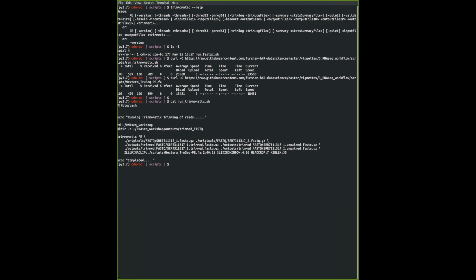Okay, better. Followed by the Trimmomatic command, again Trimmomatic and PE. This is very important because you have to specify the sort of sequences that you have as input, and as you can see, I've input the sequences as paired end. You see that I have written the arguments in separate lines. You can do so very well in a bash script.